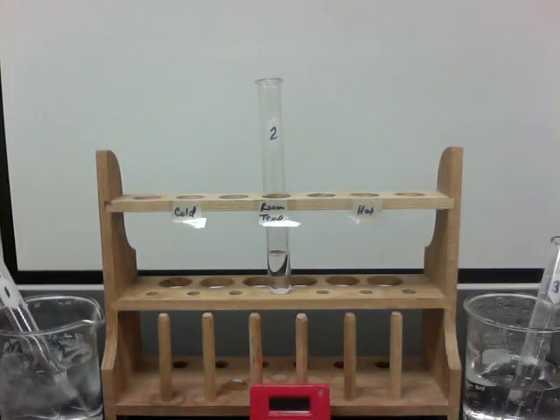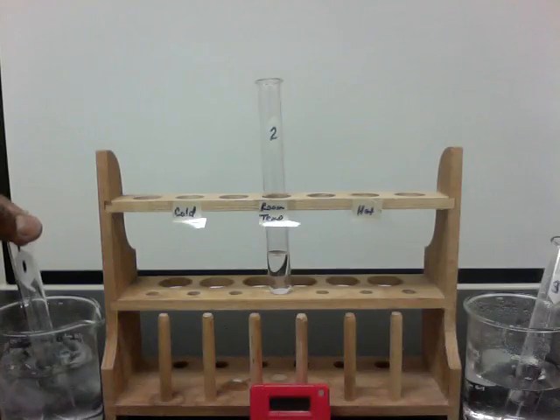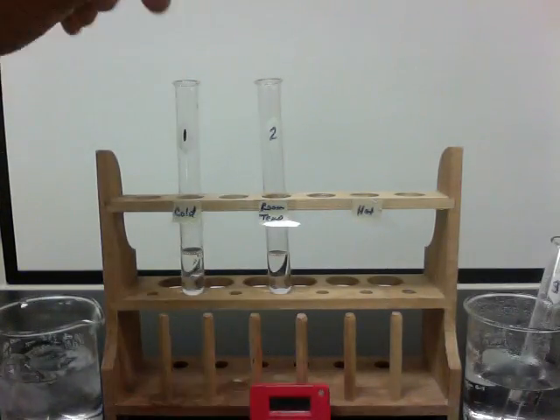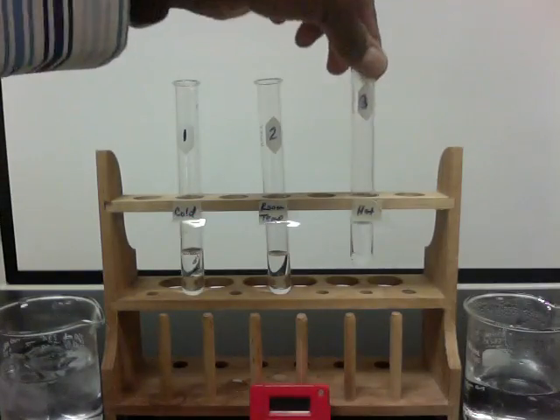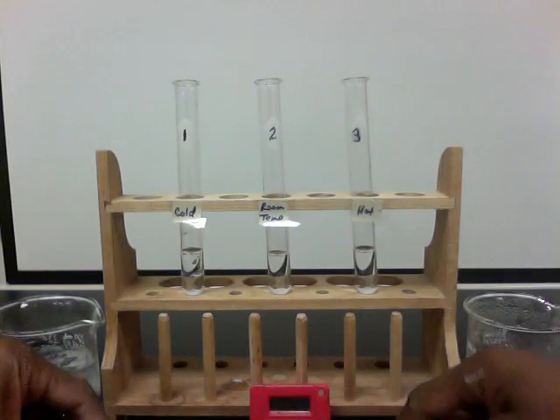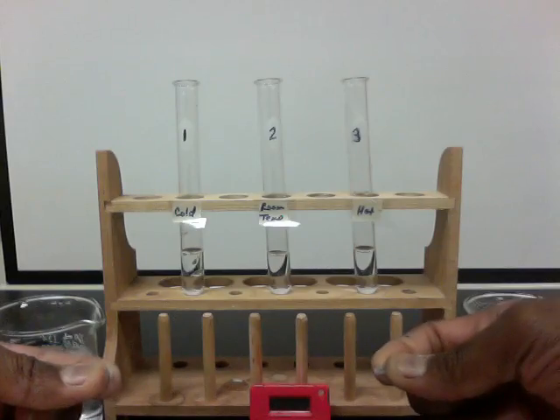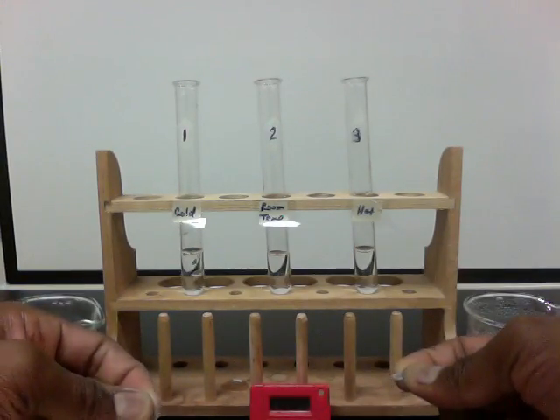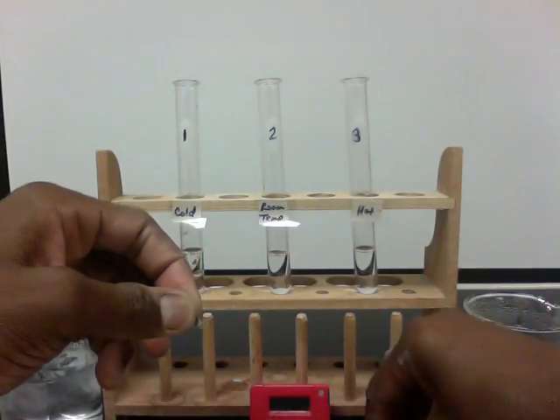Okay, let's start. I'm going to remove the acid from the cold. I'll set it here. I'm going to remove the test tube from the hot, and I'll set it here. I have 3 magnesium strips, and the magnesium strips are about 1 centimeter each. Again, I'm going to put them into our acid, and then we'll start the timer.